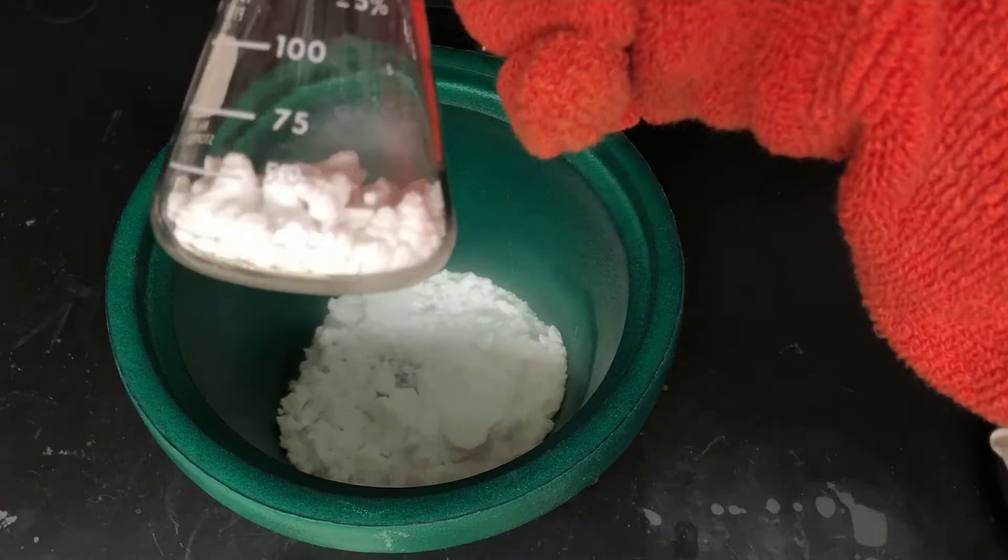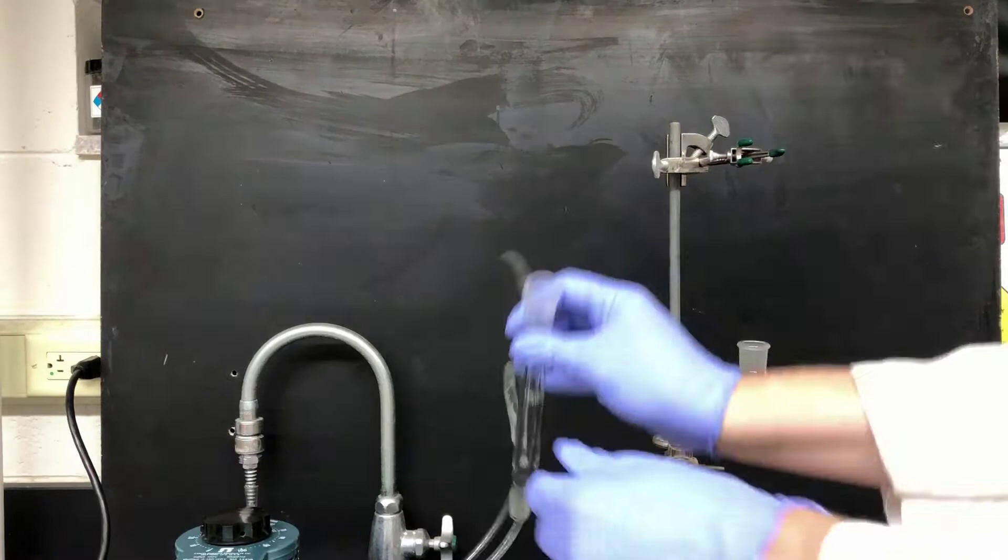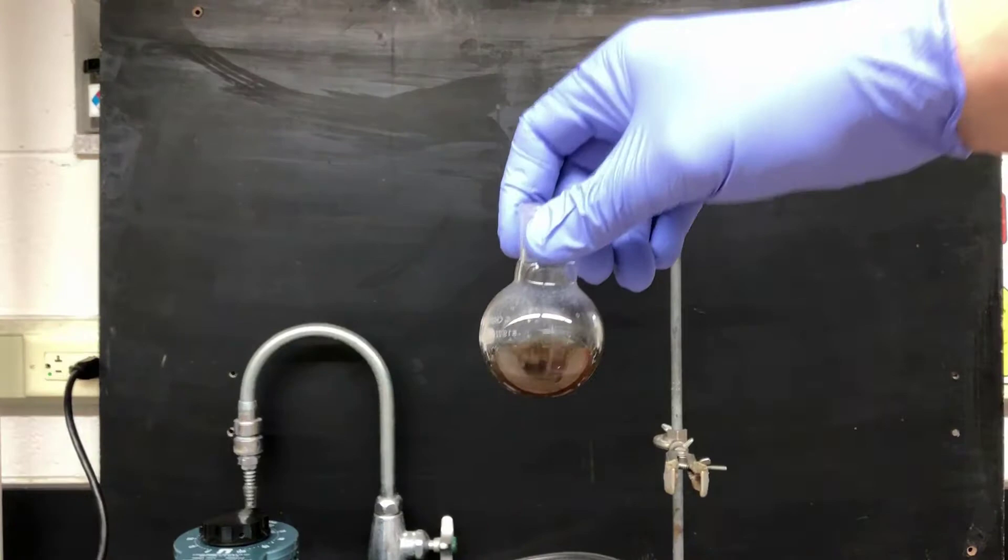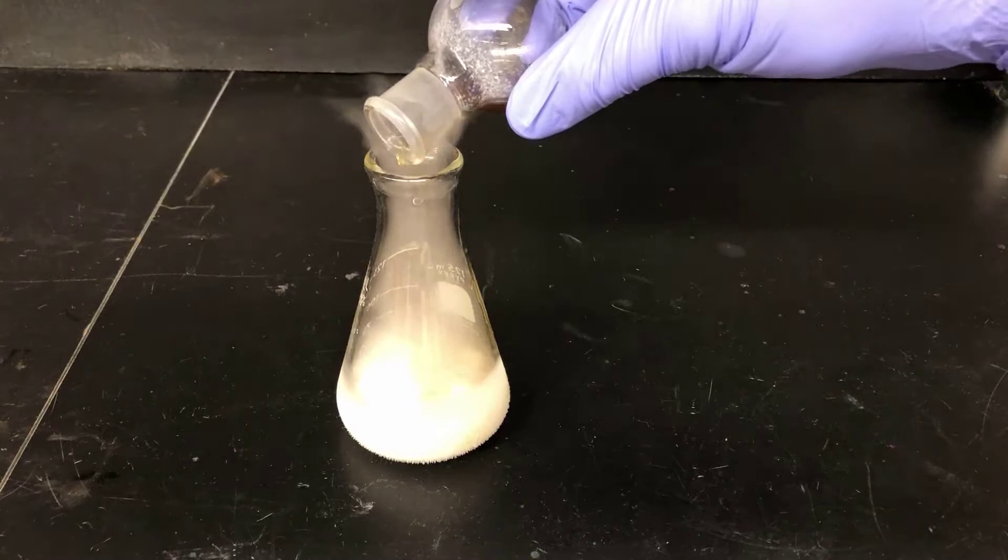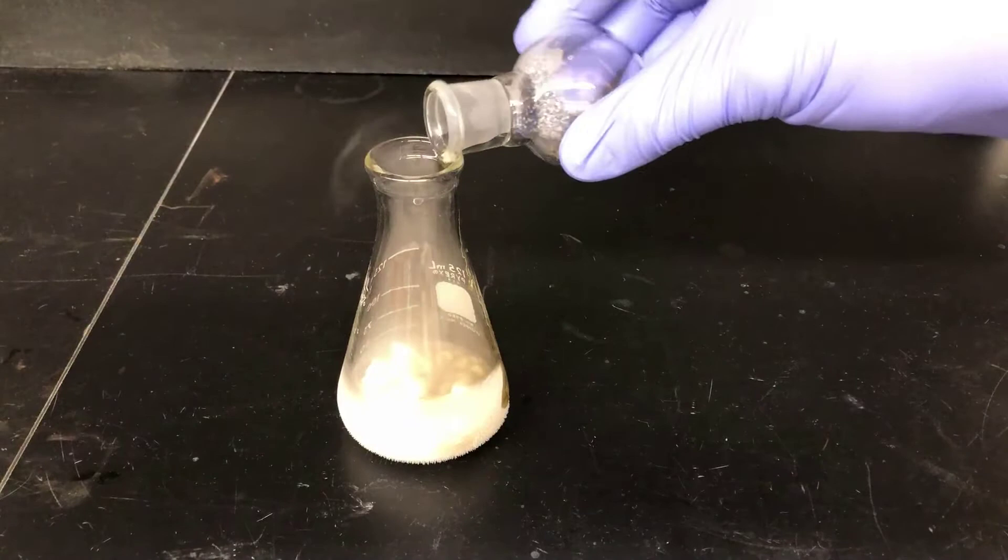Now, I'm disassembling the reaction apparatus, taking apart the various pieces, to get to the flask with the Grignard reagent solution in it. Next, I'll add the Grignard reagent to the solid CO2. This process generates a lot of CO2 gas, which you can see flowing out of the flask here. There are chunks of magnesium left over from the Grignard formation reaction, and I'm pouring such that I leave those behind in the round-bottom flask.